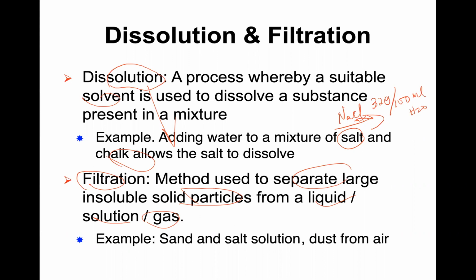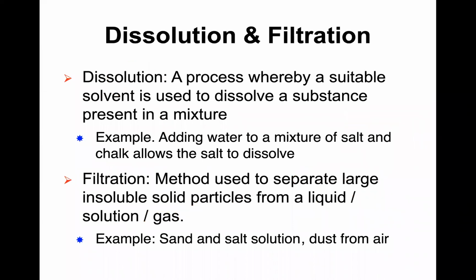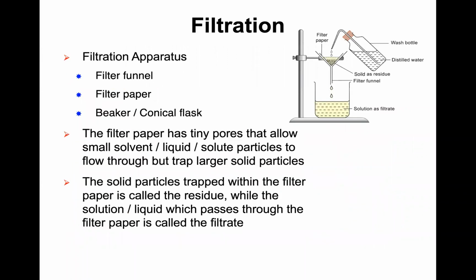The question is, if you have very superfine particles, even though they are not soluble, they will form a pad, and it is difficult to allow the liquid to pass through. In this case, filtration is impossible to do. Then we will look at the filtration.